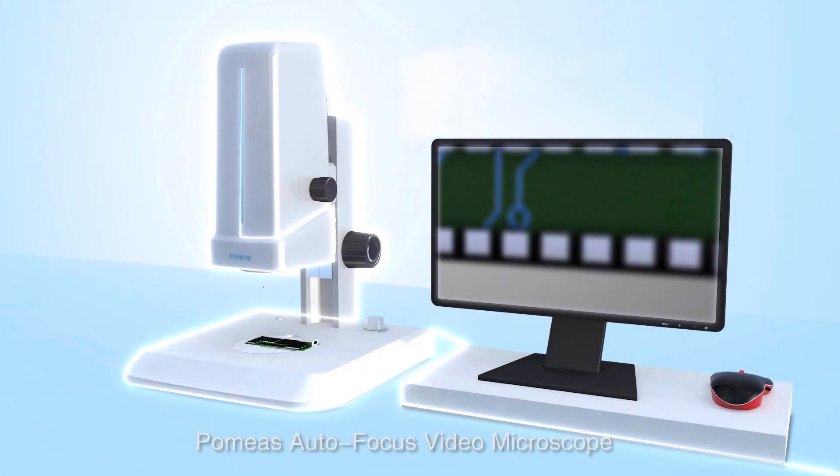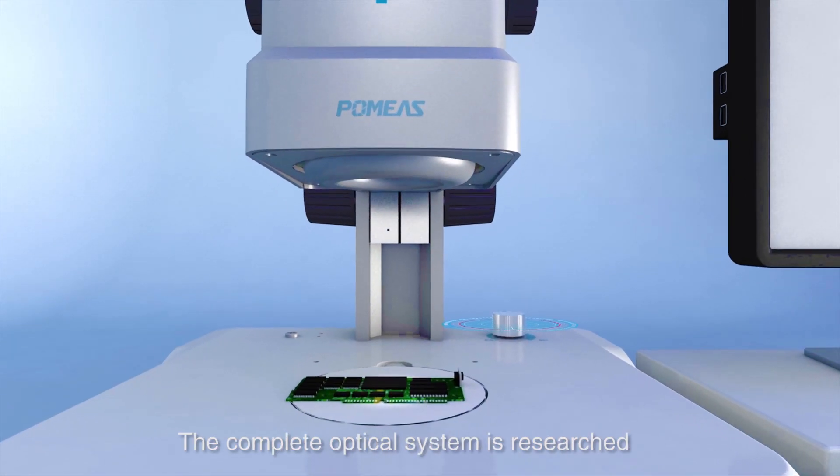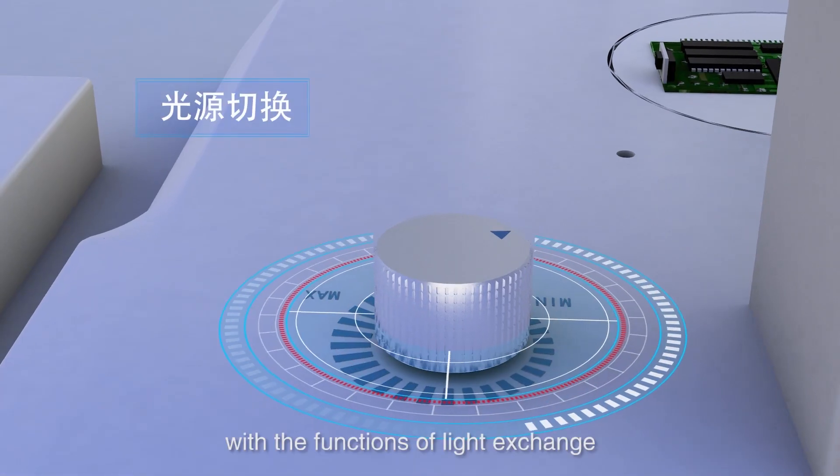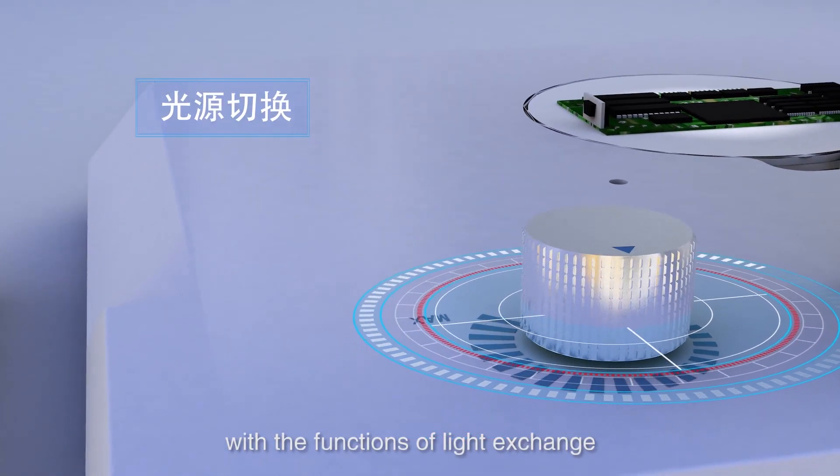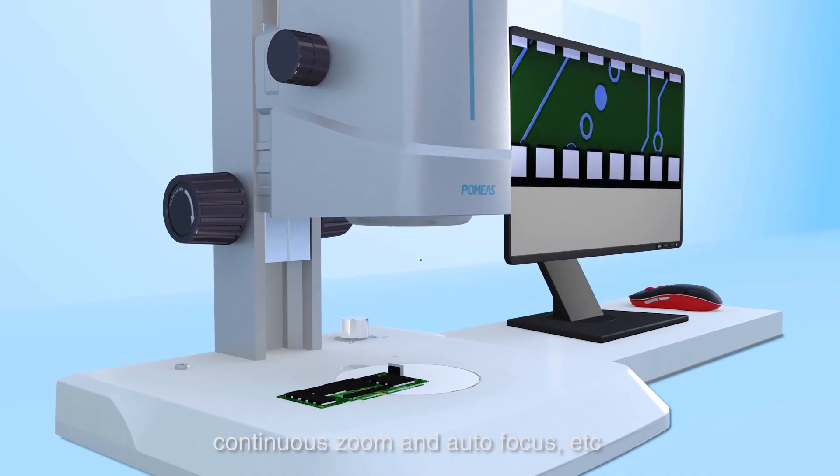Pomeas Autofocus Video Microscope is designed with all-in-one structure. The complete optical system is researched and developed by Pomeas independently, with the functions of light exchange, continuous zoom, and autofocus.